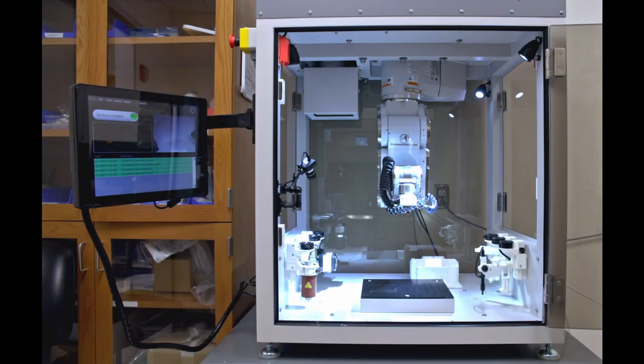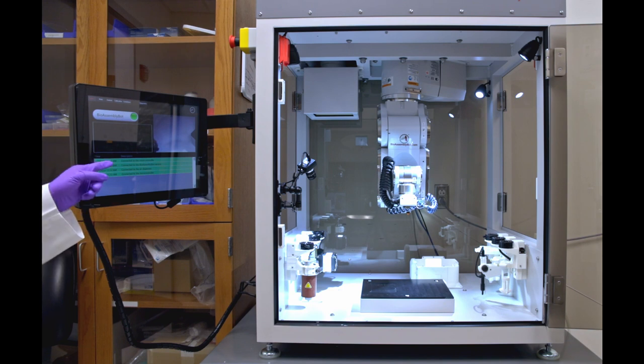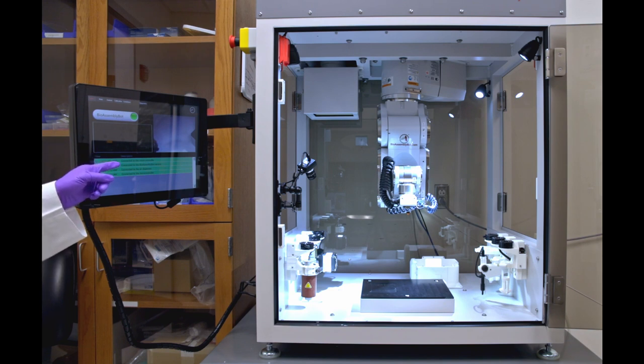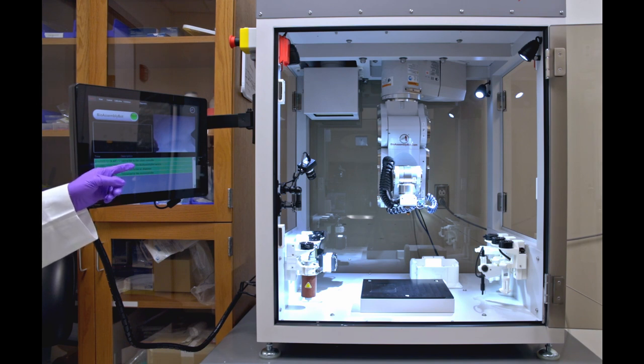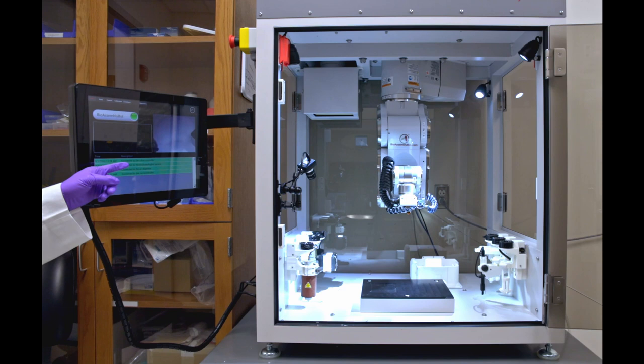The bioassembly bot printer has a robotic arm that can move in six axes. This is the touch interface to communicate with the printer. This PC has human machine software that we can use to communicate with the printer, to send print files, to do calibration, and other functions.